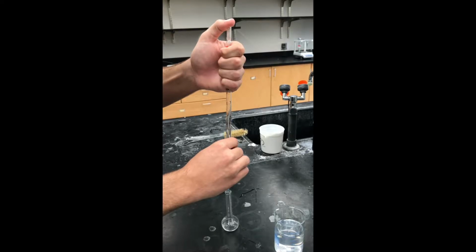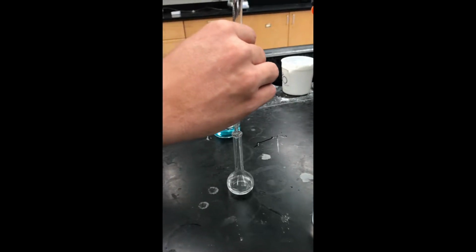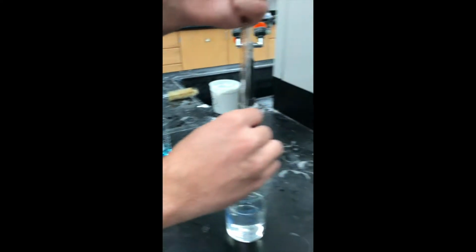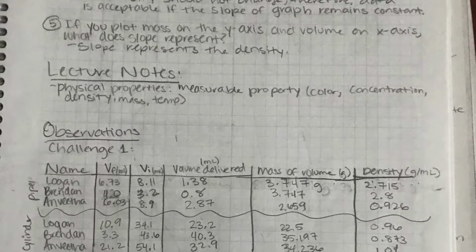The meniscus occurs because when liquid water is confined in a tube, its surface has a concave shape because water wets the surface and creeps up the side. To read the meniscus in the tube, look towards the bottom of the meniscus where it is concave and read it there. In this video, the meniscus is properly read and recorded in this lab notebook.